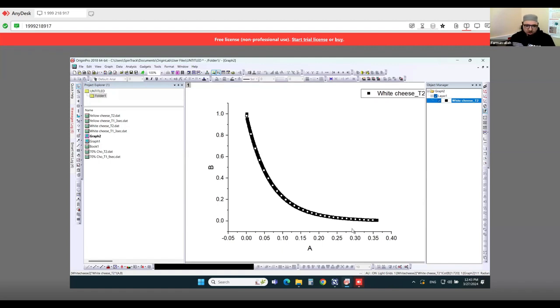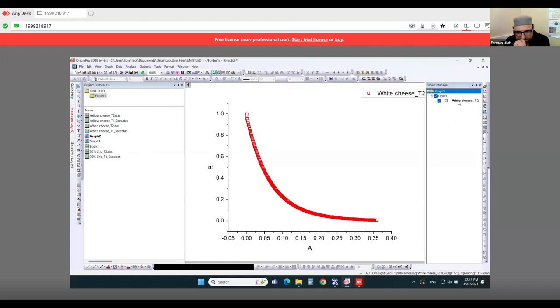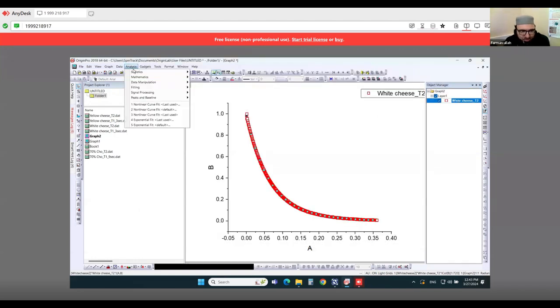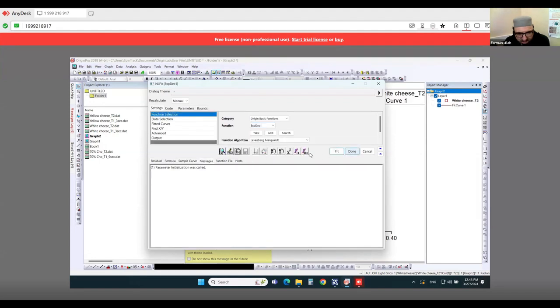As there is a lack of time, I just come to the point. You already told about how to fit, which option I will use. Let me check first the mono exponential and then I will go to the biexponential function.